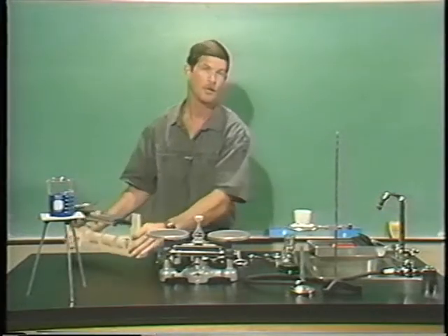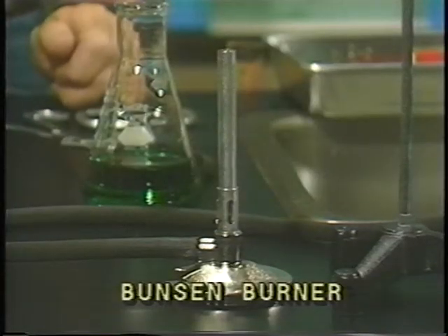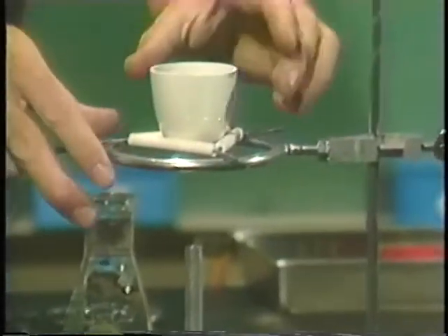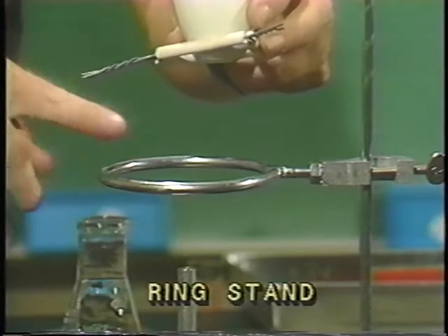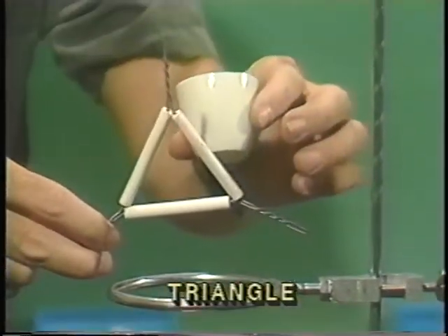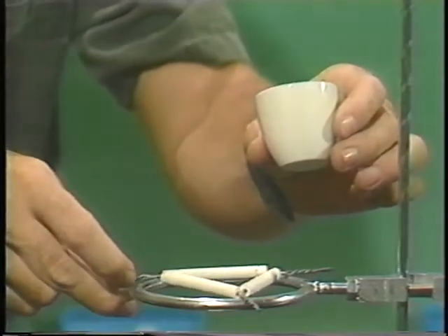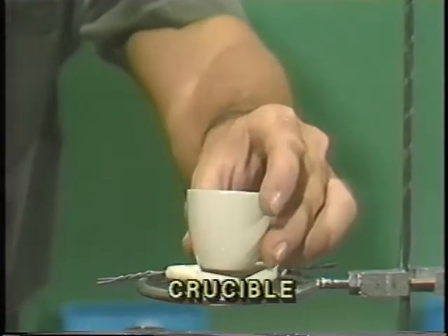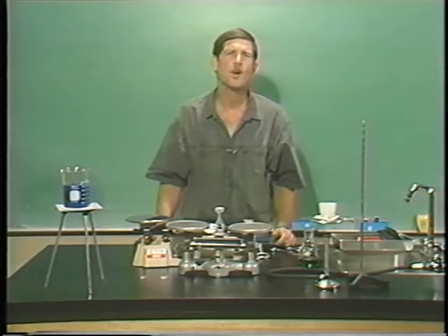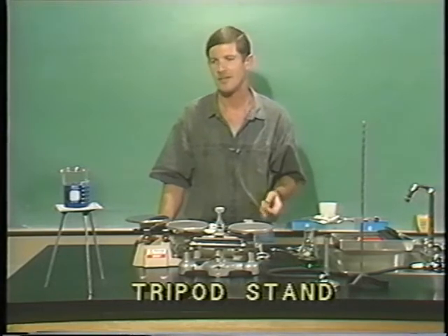Next on my left over here, we have that famous piece of equipment, the Bunsen burner, invented by a man named Robert Bunsen. Next to the Bunsen burner is what we call a ring stand. It's a stand with rings on it. This ring stand has a triangle in it, easy to remember because it's in the shape of a triangle. It's used to hold things. And of course, I'm going to set my crucible in the triangle. Over on my right, I have what's called a tripod stand, easy to remember because it's got three legs.